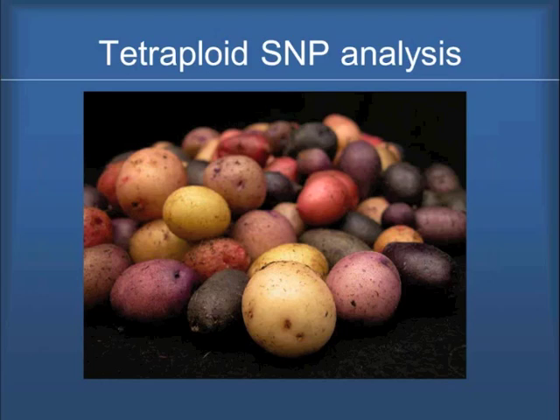I had one that was actually from Robin's talk that I just missed, and someone asked about the condition that SNPs had to be at least 50 base pairs apart. If you don't want to take that now, it's okay, but that was asked. We'll come back to that. It's just an Infinium design question.